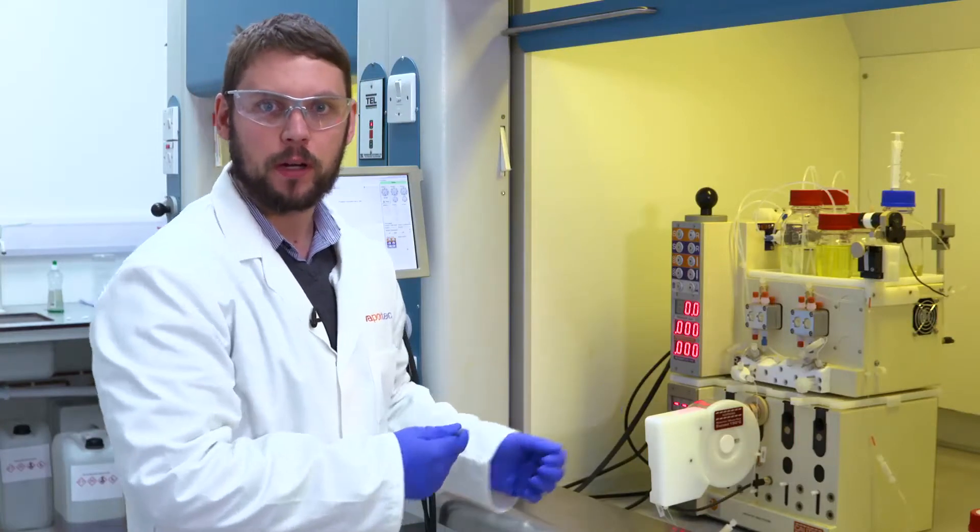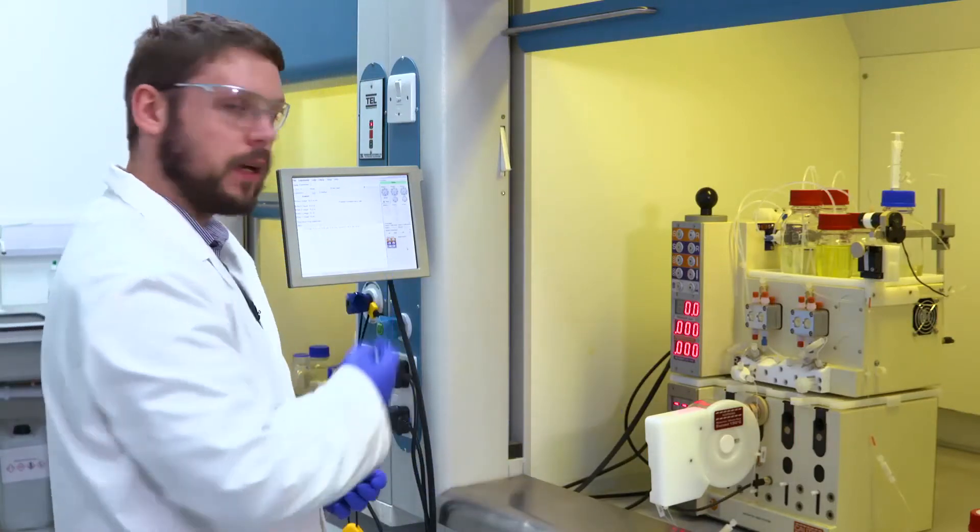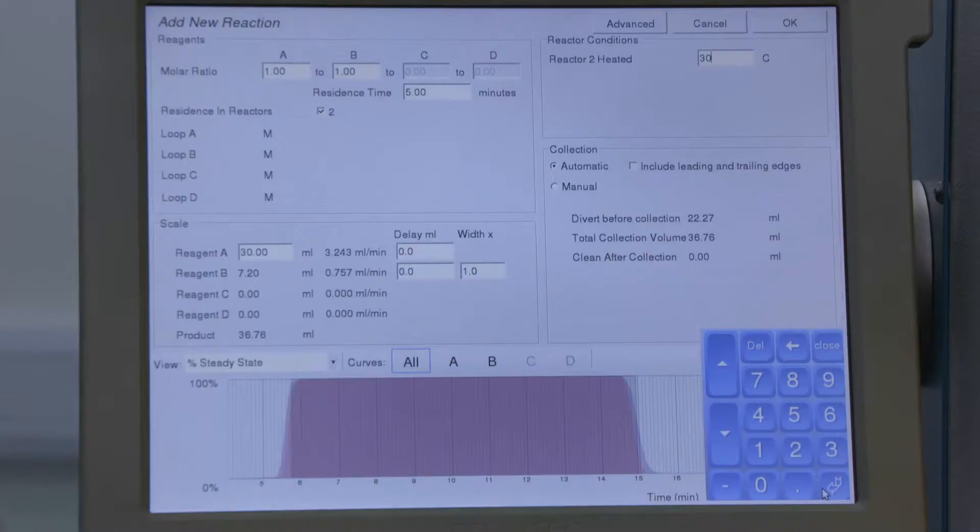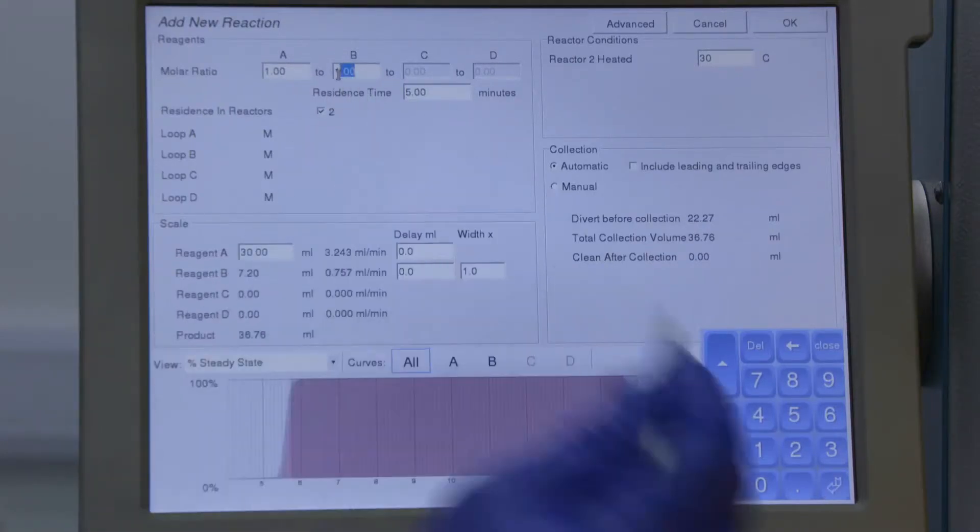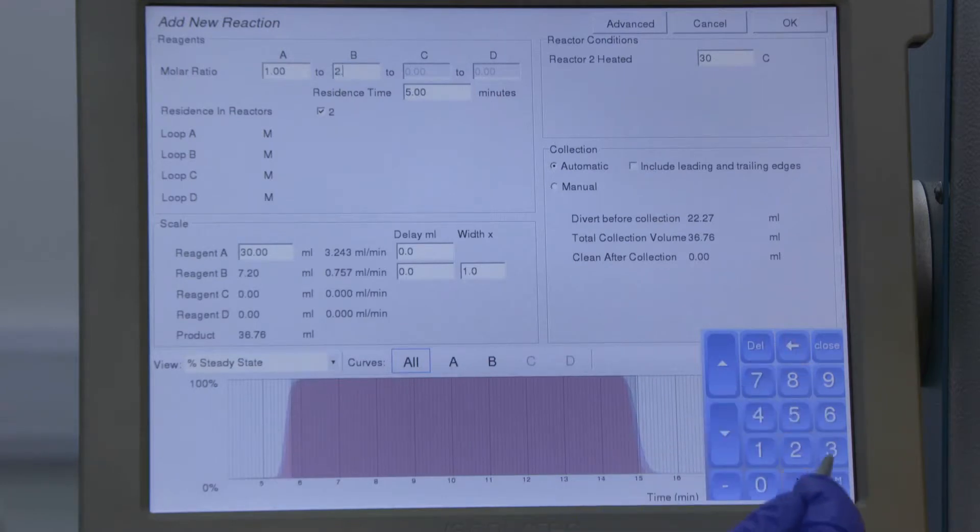So now I've got the system ready for the experiment. I need to actually program the experiment in FlowCommander. This screen allows me to design my experiment in more detail. So I can tell FlowCommander what molar ratios I want, what residence time I want inside the reactor.